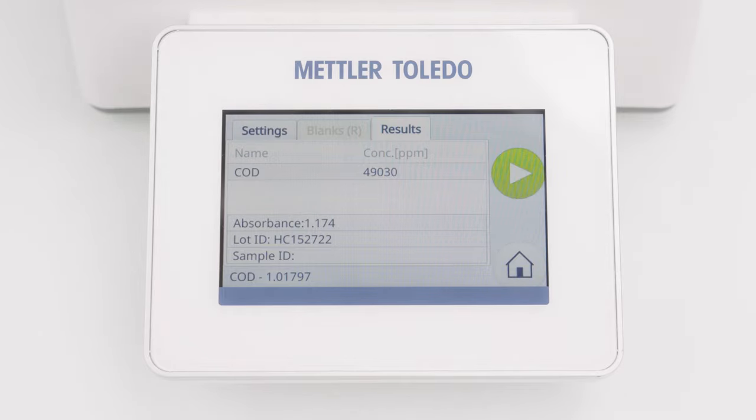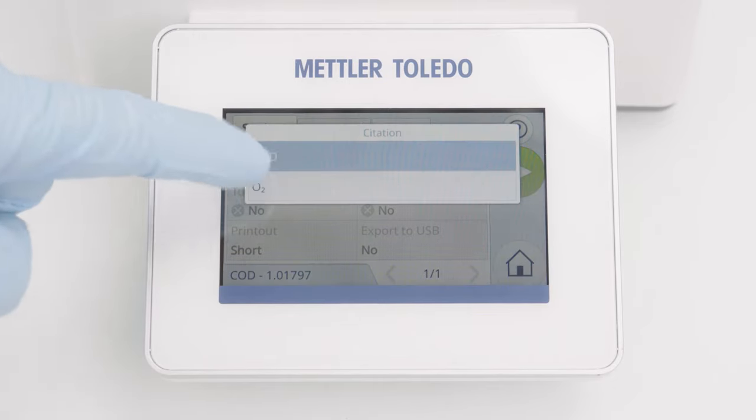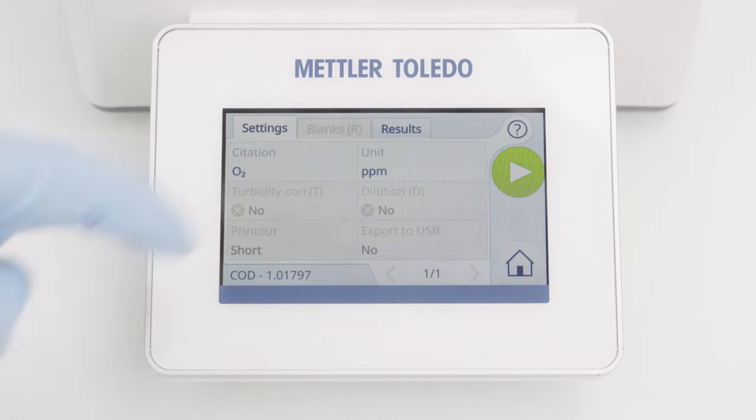On the Results screen, I can change the citation and unit, and the result will be recalculated automatically.